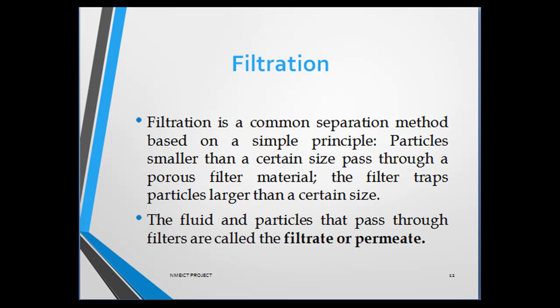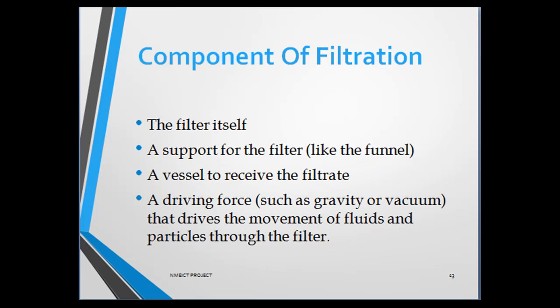Depending on the application, the sample type and the scale, filtration systems can vary greatly. Regardless of the simplicity or the complexity of the filtration system, the following 4 components are important. Which are they? The filter itself, a support for the filter, like the funnel, a vessel to receive the filtrate, and a driving force that drives the movement of fluids and particles through the filters.